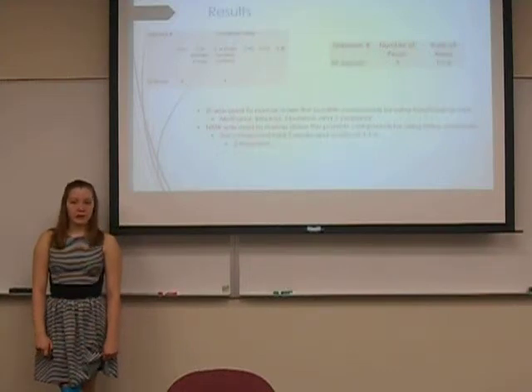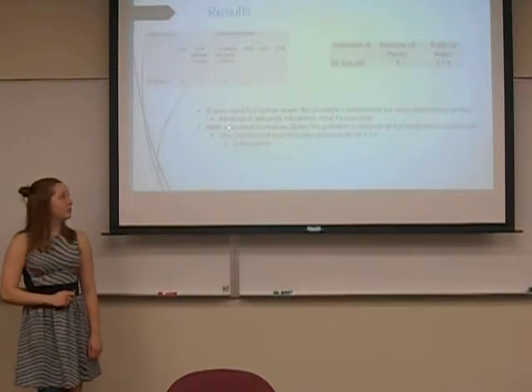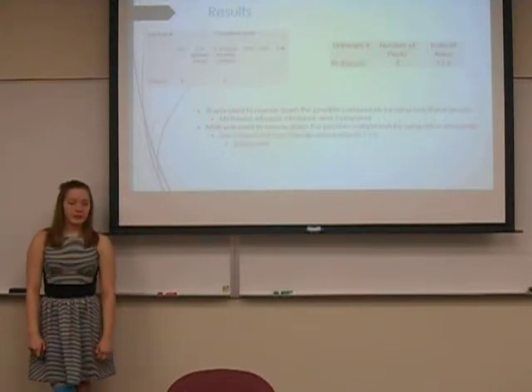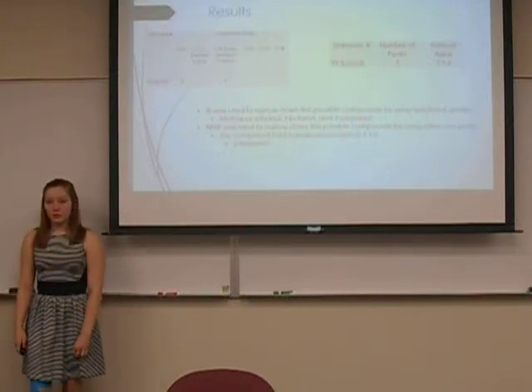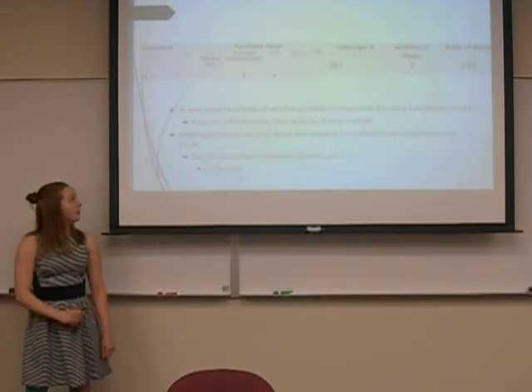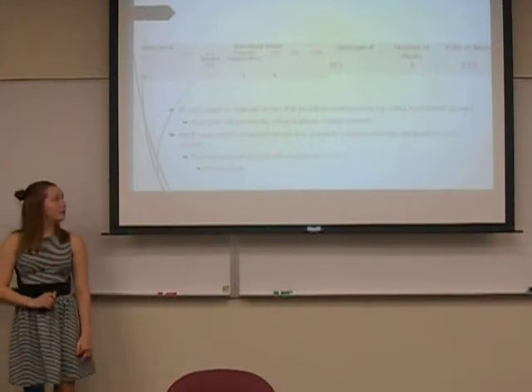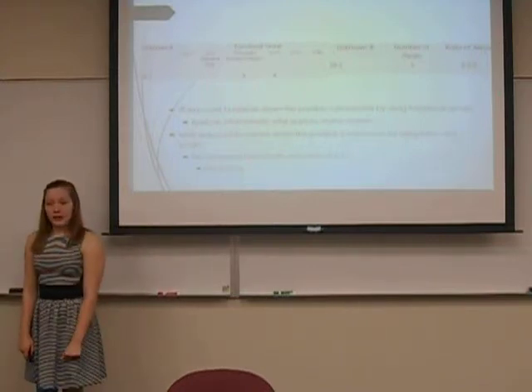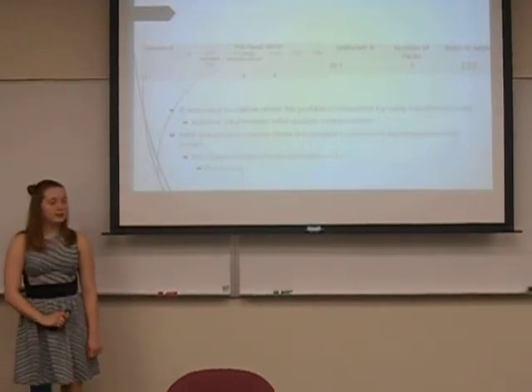In our first one, we are able to use our IR groups of the hydroxyl group and the C to H singly bonded carbon to determine that it could be one of these 4: methanol, ethanol, T-butanol, or 2-propanol. By using our NMR spectra and seeing that we had a 6 to 1 to 1 ratio with 3 peaks, we were able to finally determine that it was 2-propanol. In 59.1, we again use the same way of determining this to look at our IR and NMR spectra, which then the IR narrowed it down to acetone, ethyl formate, ethyl acetate, and methyl acetate. By looking at our NMR spectra, we noted that it had 3 peaks as well as a 2 to 3 to 3 ratio and allowed us to see that it was ethyl acetate.